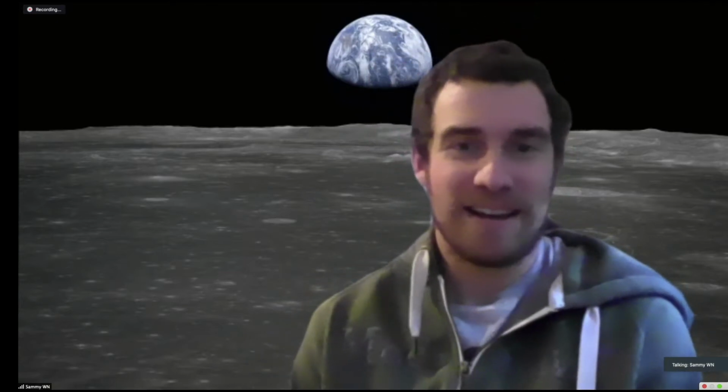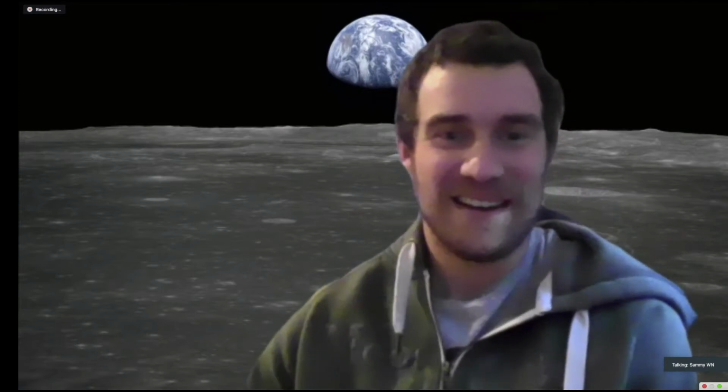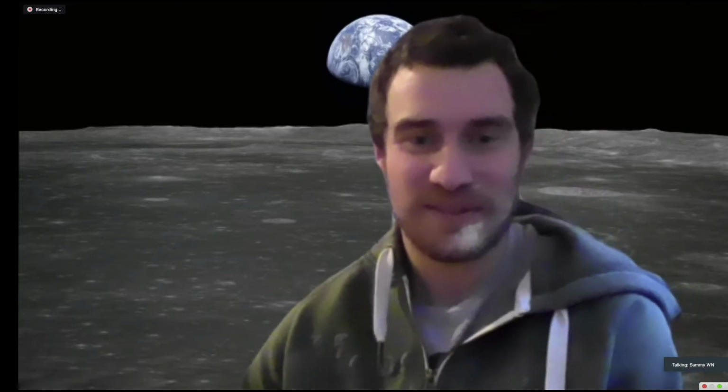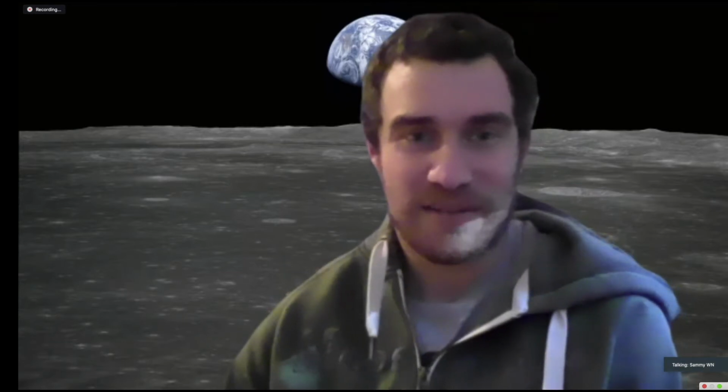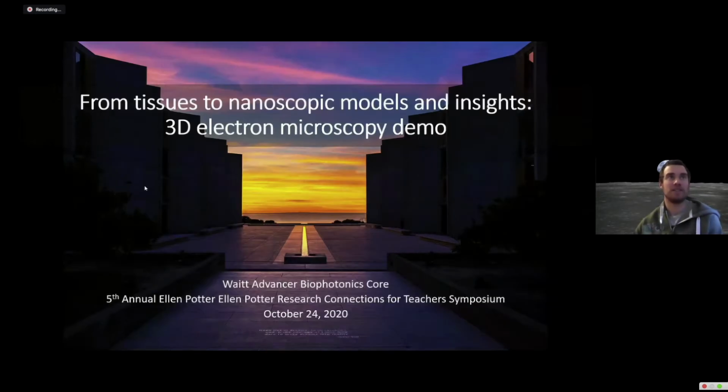Hey, thanks so much for that wonderful introduction, Madison, and thank you all for being here today, and thanks everybody for that great talk. I think it really set the stage for this demonstration. So I'll go ahead and share my screen, and hopefully there's plenty of continuity between Uri's presentation and mine. I'll try to give a little more of a technical overview of how we generate some of this data, and give you a little insight into the nitty-gritty.